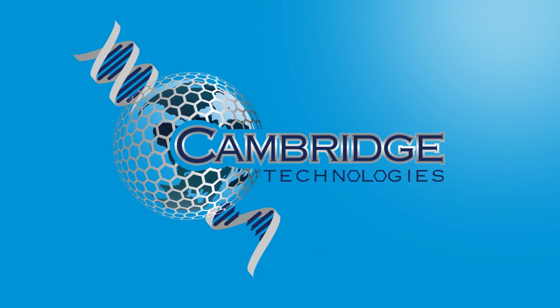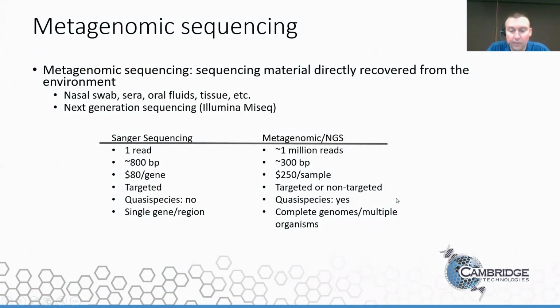So yeah, as Mike mentioned, I'm going to talk about metagenomic sequencing and how we use that here at Cambridge Technologies. I think most people are familiar with what metagenomic sequencing is. If not, the metagenome is essentially all the genetic material in a sample. The sample being an environmental sample.